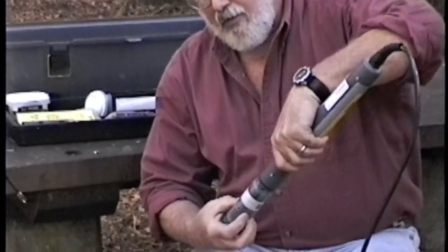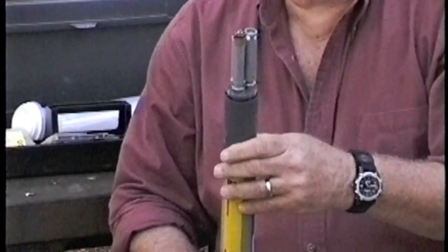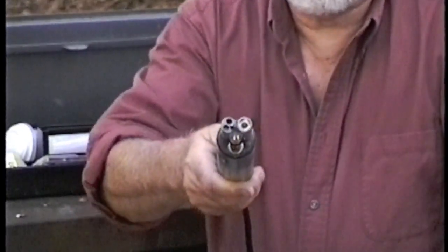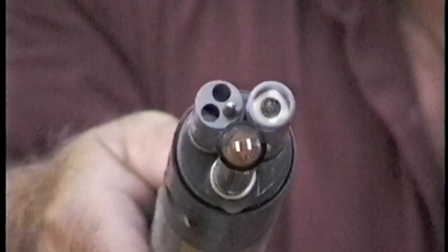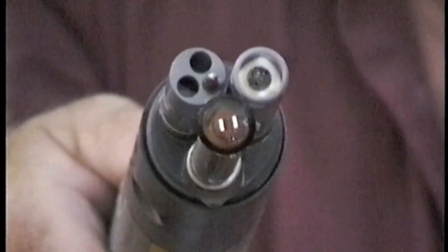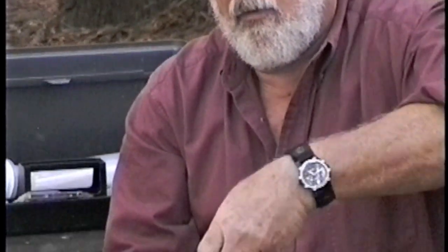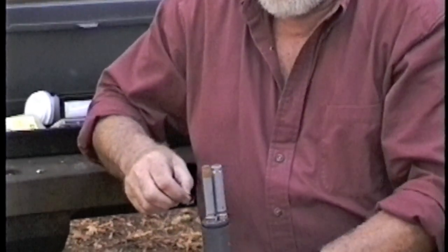The first thing we do is we remove the probe cup. You'll note this particular instrument has the dissolved oxygen membrane already installed. I'll remove it. But I want you to take a look and see the condition of those electrodes — they're very shiny. The membrane is smooth, there's no wrinkles, there's no bubbles. The membrane is very closely cut to the side of the instrument so there's no waste or no extra membrane hanging out on the side.